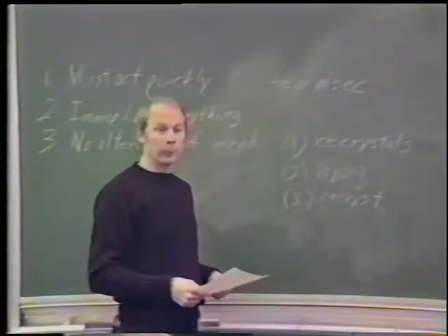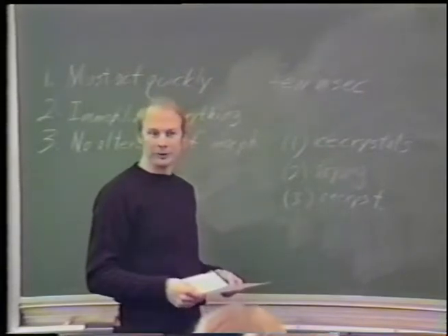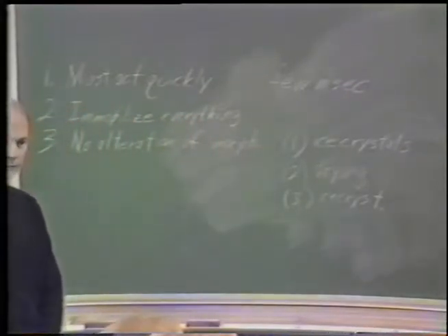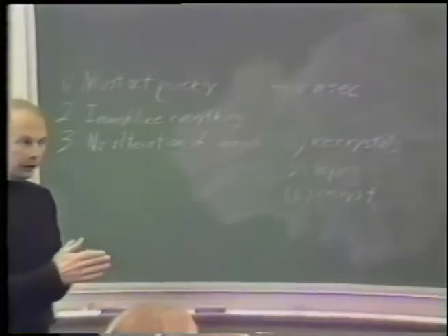It's safest to keep any sample below -70, no matter what it is. Yeah, that's pretty easy to do. Are you going to talk a little later about how long you think you should be below -70 for various things? Yeah.